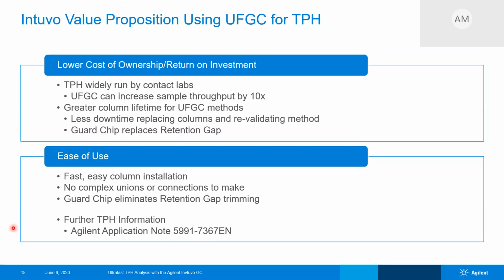Yeah, I know that with the first generation of Intuvo, particularly if we're running high temperatures, there have been some decoupling of the heater element from the guard chip heater. Those have been redesigned, and there was a service note that was put out, and so those can be upgraded. And the other thing you want to make sure is that you don't heat the guard chip more than necessary.